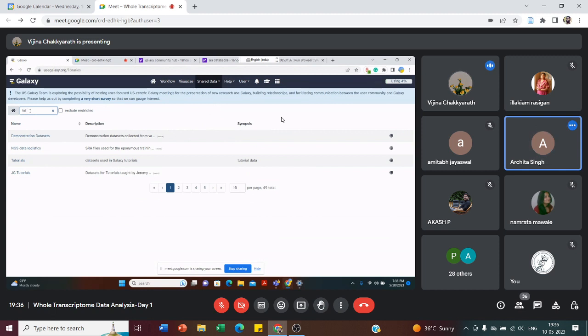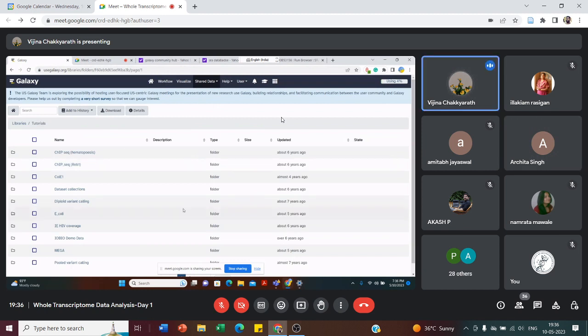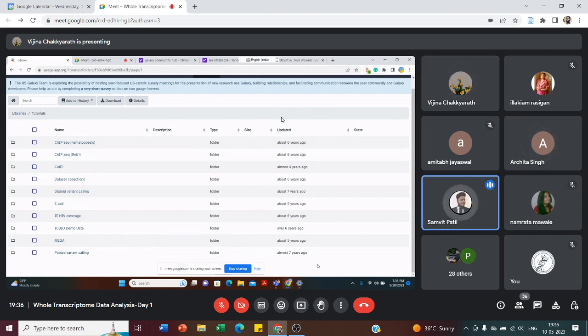Then click here on that tutorials. Okay. For me, it's not showing here. Like the second page, it will come, and you can go. You just go to the second page, and it will show the data. Maybe you can try clicking on the hide option. I got it. Oh, thank you.